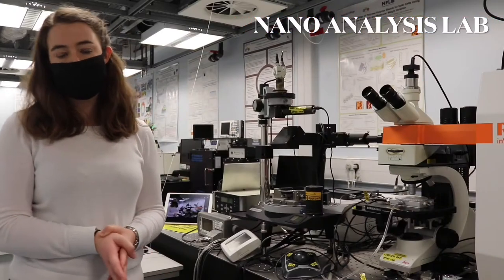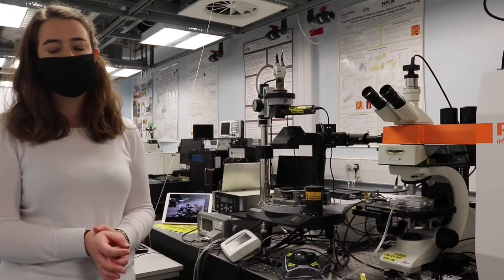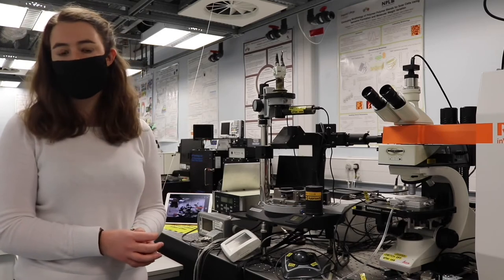Welcome to the Nano Analysis Lab. Here we specialise in the characterisation and analysis of materials for energy and healthcare applications.